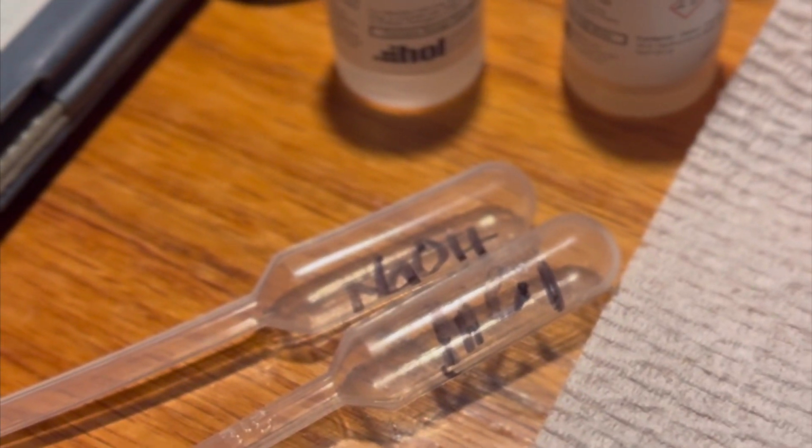Now we will be adding 4 drops of sodium hydroxide into each of the 4 wells. I've named one pipette sodium hydroxide and another hydrochloric acid. So let's measure 4 drops of these into each of the wells. Okay, that should be enough for each well.